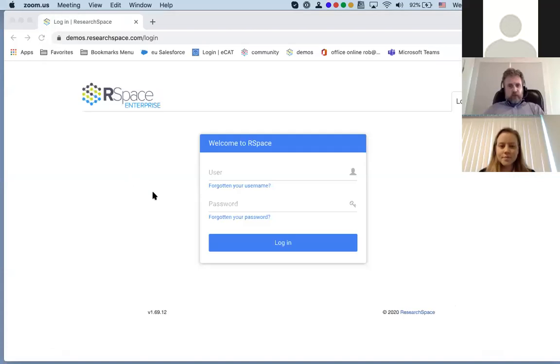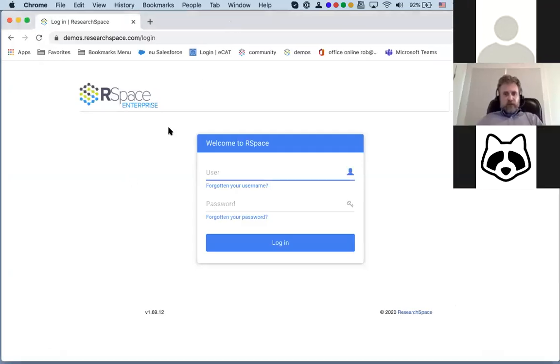Hi everyone, I'm Rob Day. I'm Head of Sales and Products for ResearchSpace. I'm going to go ahead and share my screen with you now so that we can see the RSpace interface. Hopefully everybody can see that. Anita, can you see that? Yes, I can see it.